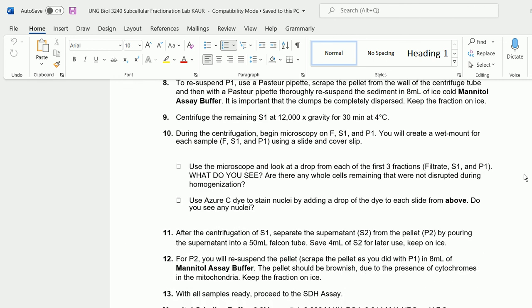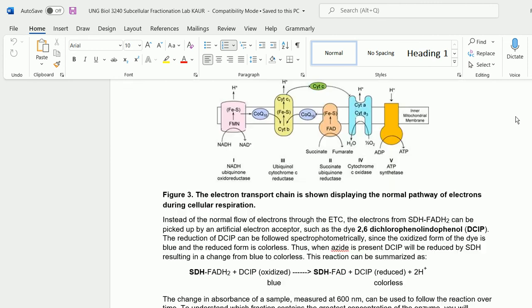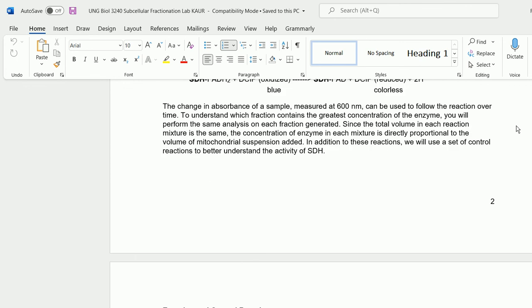So this is the table according to which you are going to make your cuvettes. Remember that you have 5 fractions, and for every fraction, you have to make the blank. Okay. Now, what is a blank and why are we making it?